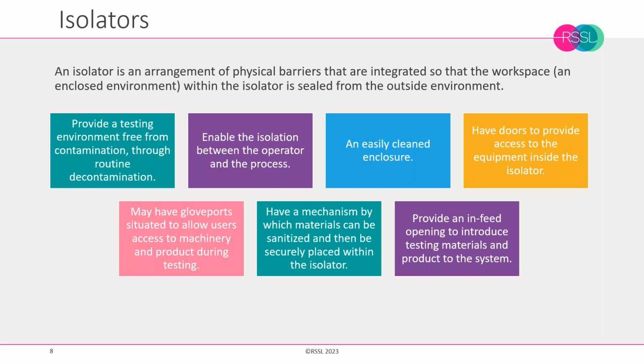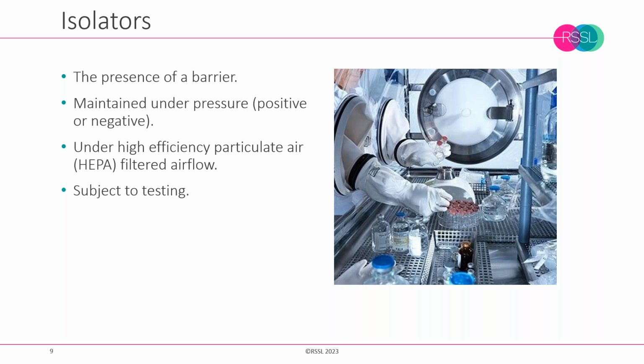Also need this mechanism for transfer, as I mentioned, and for getting waste out as well, which is also very important. Okay, so that's kind of a broad definition of isolators.